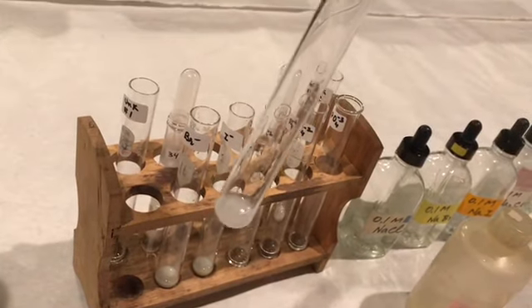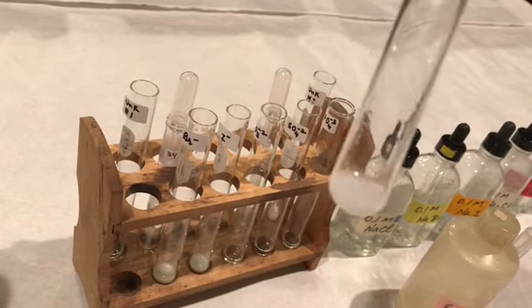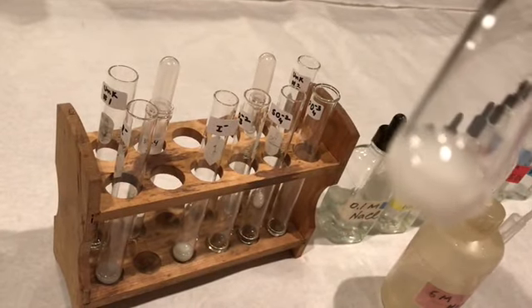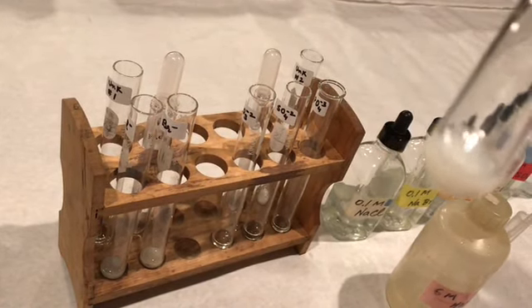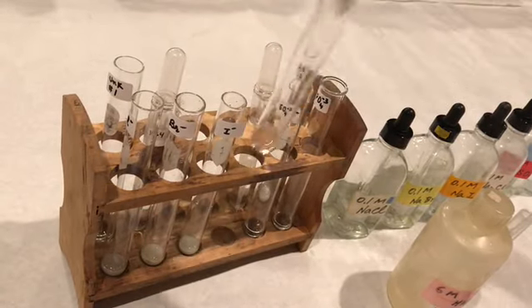After adding nitric acid, this is the chloride ion. Bromide ion. Iodide. Carbonate.